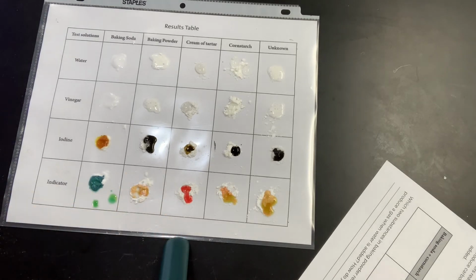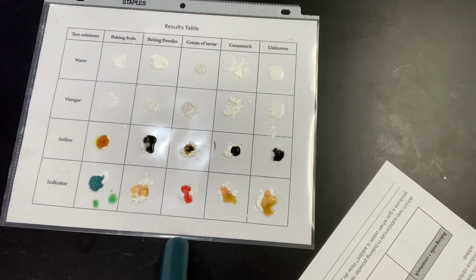And that one's pretty clear. Okay, take a look at those for a moment. Make your observations and tell me what the mystery substance is.